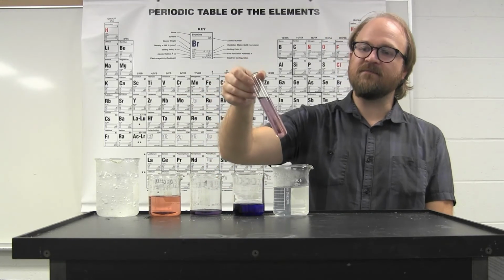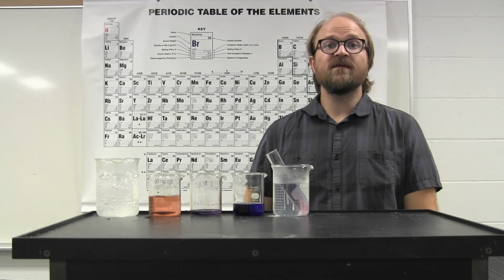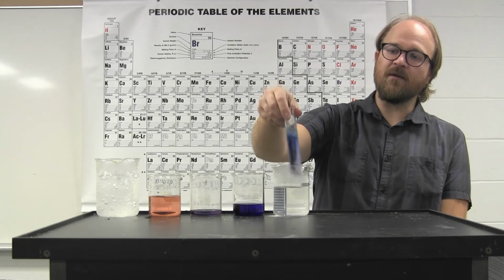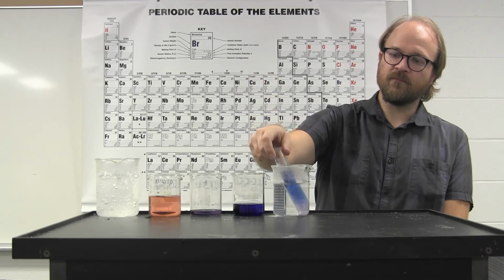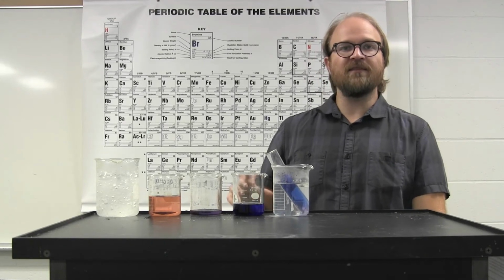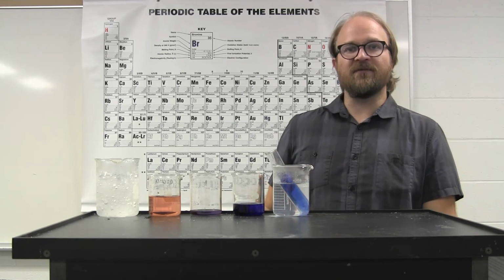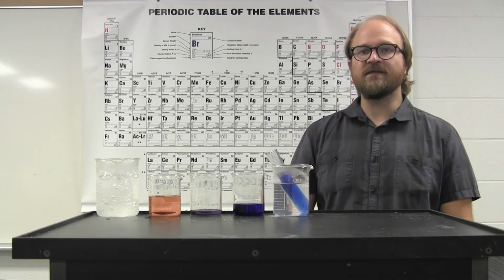However, if you take this same solution and place it in warm water, the reaction itself shifts to the opposite end of the equilibrium, overall forcing it to go more to the tetrachloride complex and become a blue color. This equilibrium shift can go back and forth depending on the temperature. And overall in this experiment, you're looking at the temperature dependence of this equilibrium reaction by looking at the equilibrium constant at 3 different temperatures and plotting this to figure out the enthalpy and entropy of this reaction.